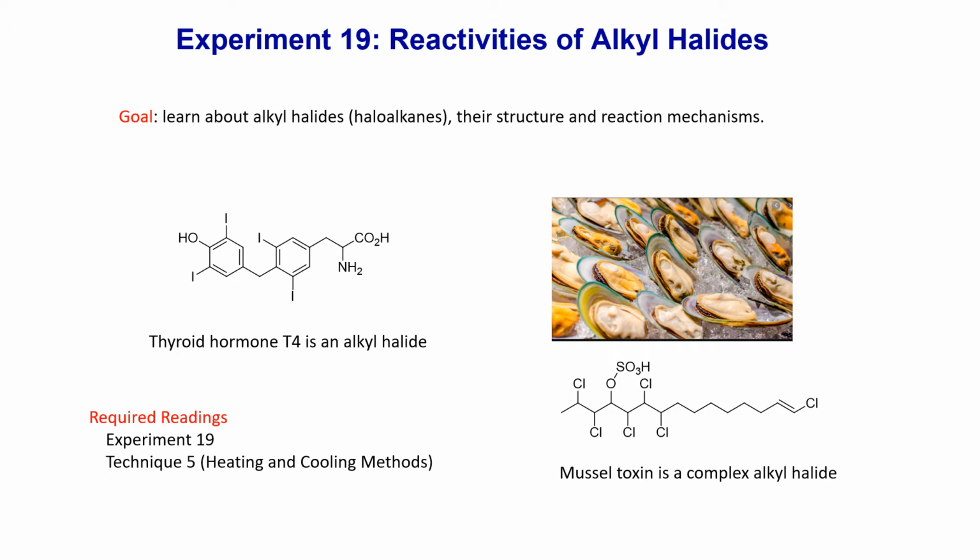So we're going to learn more about alkyl halides. Make sure to read up on experiment 19, the lab procedure itself. It is a required reading, and technique number 5, which is heating and cooling methods. Okay.